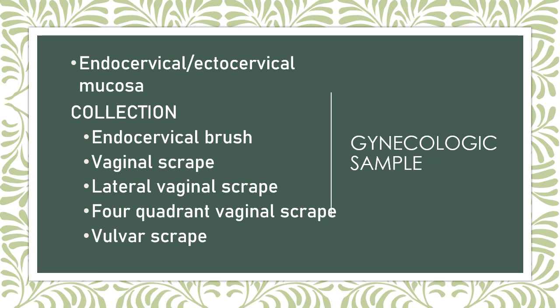For your herpetic lesions, you have your herpes simplex. So that is for your gynecologic samples. Again, your vulvar scrape is for the detection of your herpetic lesions or cancers.